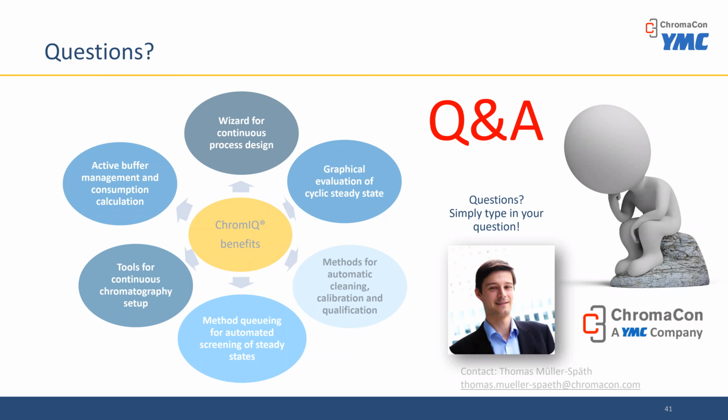Thank you, Thomas. Now for the next question. For MCSGP, inline dilution is required. Hence, how is this being controlled to make sure the conductivity is low enough prior to loading on CEX column?